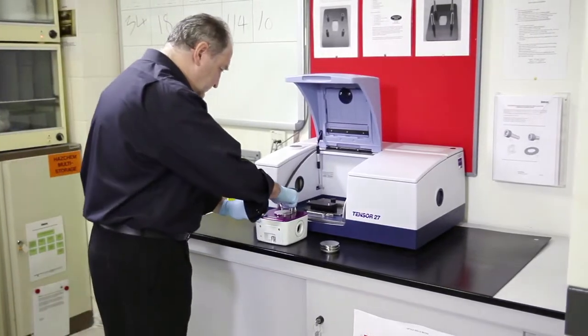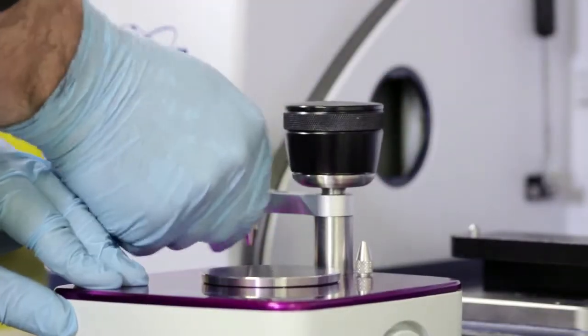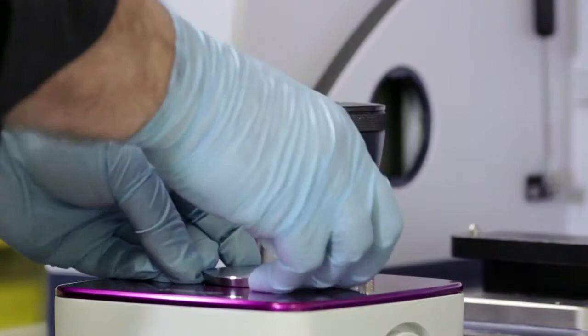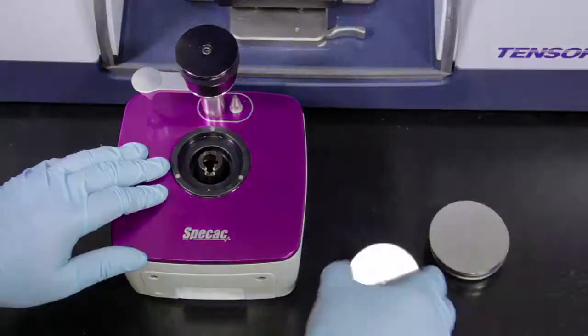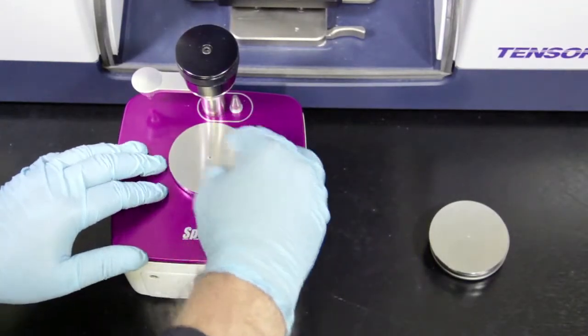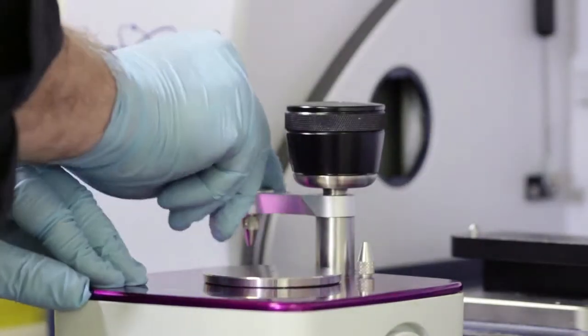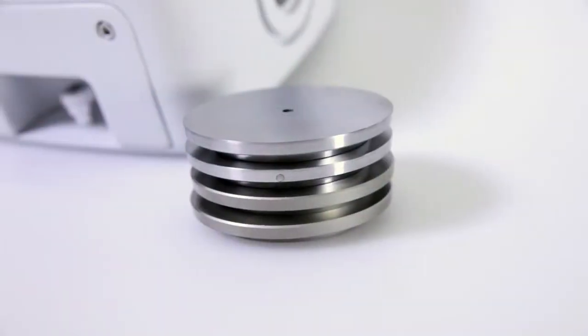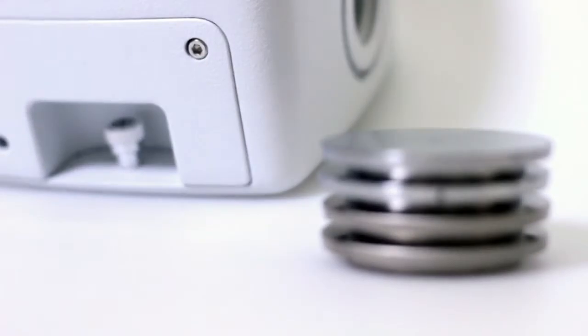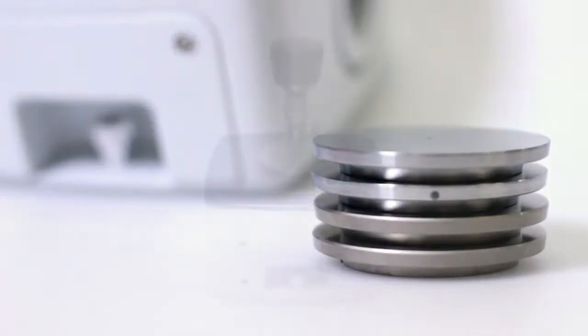Interchangeable ATR crystal pucks easily fit upon the optical unit and are magnetically held in place. A choice of four crystal pucks are available for the Quest, including two configurations of strong and durable monolithic type IIa diamonds, a zinc selenide and germanium crystal option.